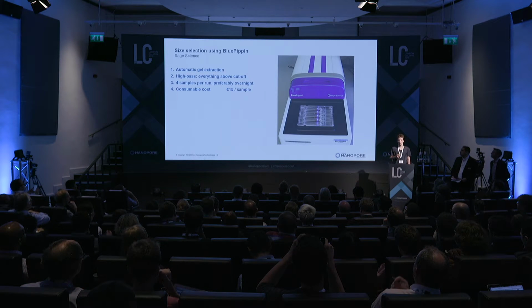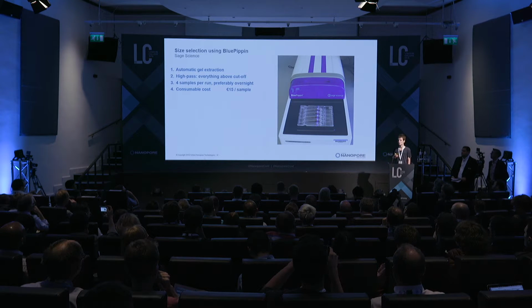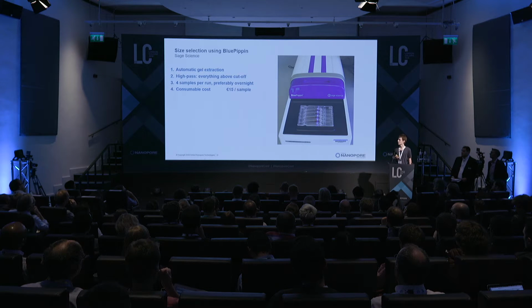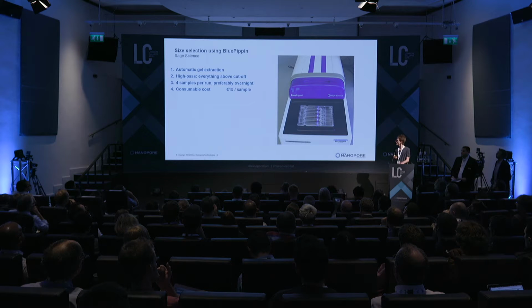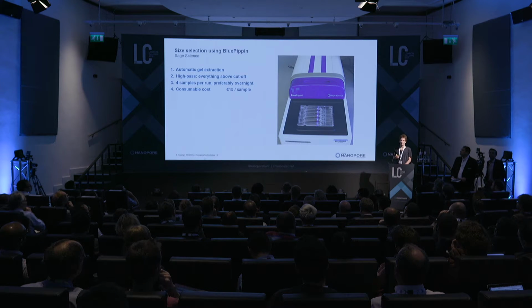And at this point, I use size selection on the BluePippin to eliminate the smaller fragments. Our current machine enables four samples in parallel, and its bigger brother can do 22. So essentially, this machine performs an automated gel extraction aiming for a predefined size range. And specifically, I would like to remove everything smaller than 8 kb from my prep.